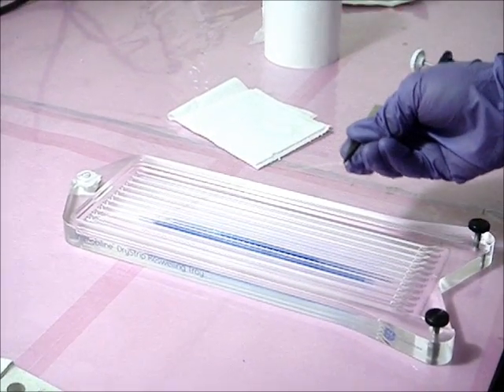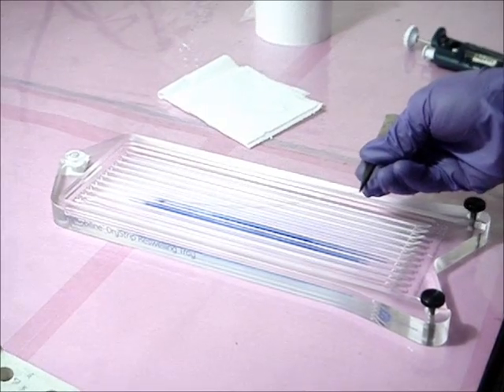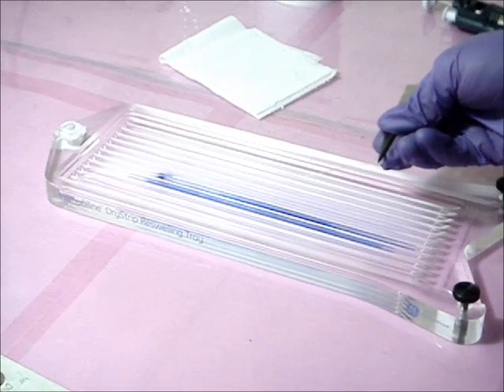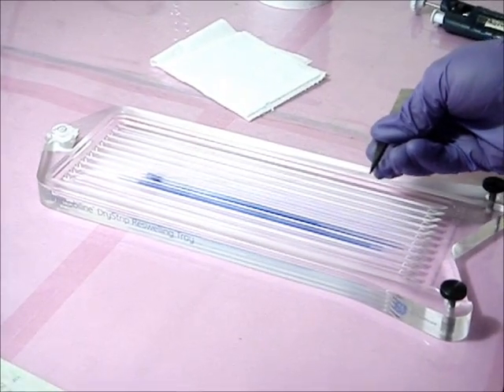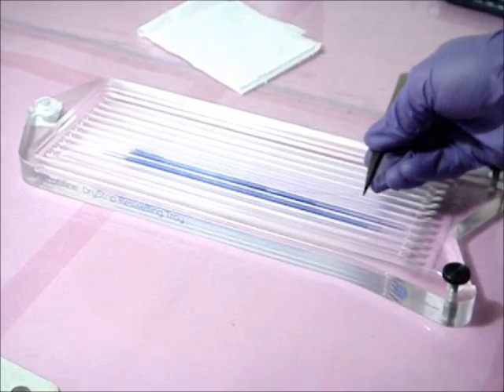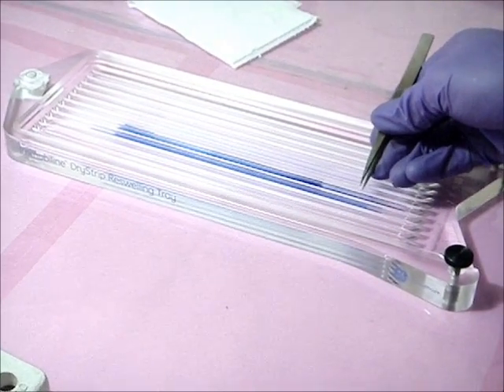Coat the strip with mineral oil and cover the setup with a lid. Leave this setup undisturbed for a minimum of 10 hours. During this time the strip will take up the sample and the rehydration stock.